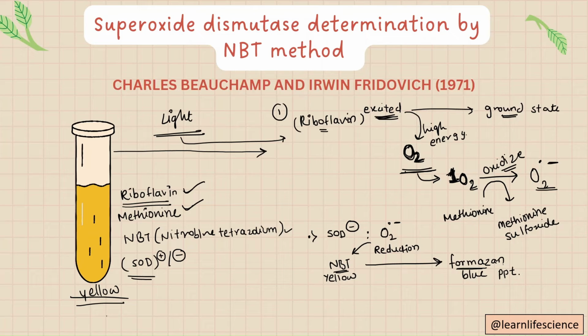Okay, if it is clear to you, you can see that the aim of this overall reaction was the generation of the substrate, meaning once the substrate is synthesized, it is provided with another substrate which it can reduce for the analysis of its concentration.